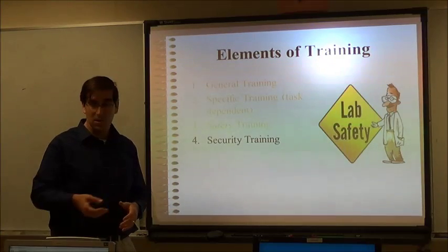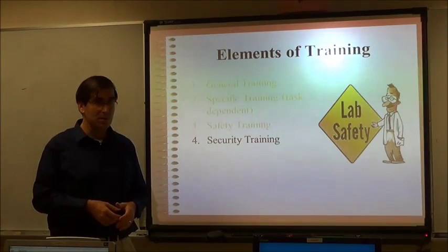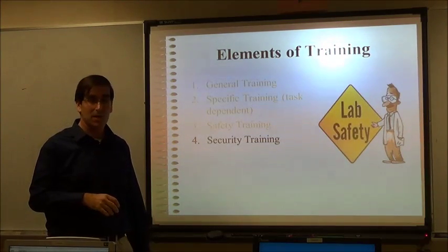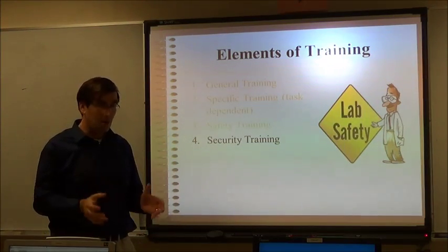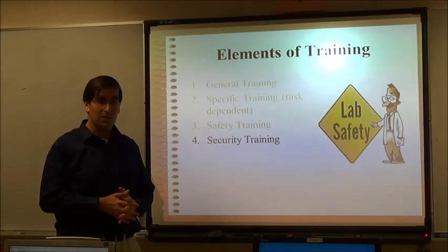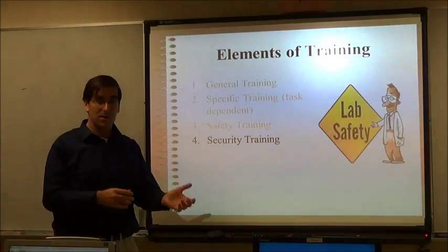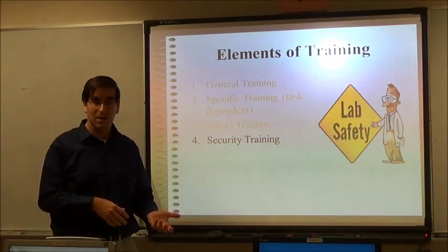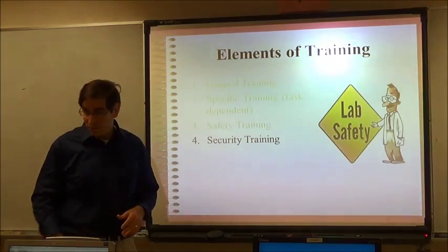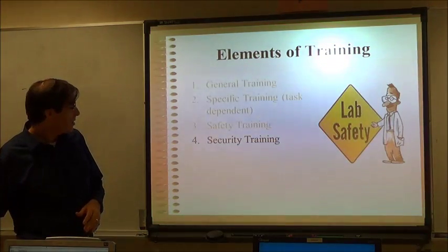Obviously, we're sitting here, these computers are for the most part bolted down, and the same thing in the laboratory. We work with chemicals, things that if in the wrong hands could be potentially dangerous to someone. And we have to order them through specific regulations. We have to have permits in order to get them, and we don't want people to just wander throughout the labs. So we'll get into a bit of security training.